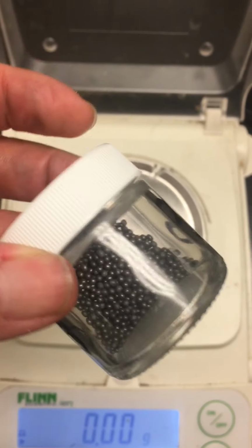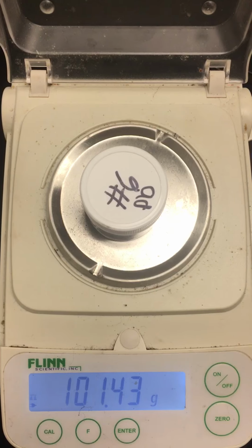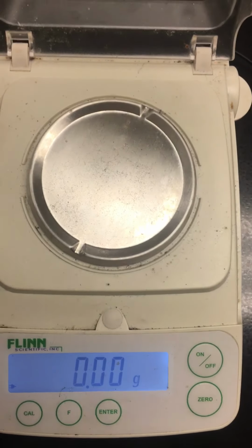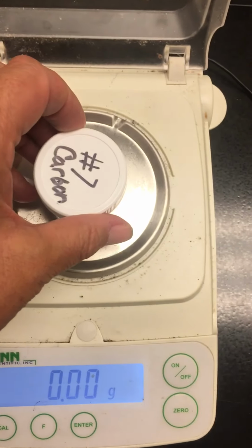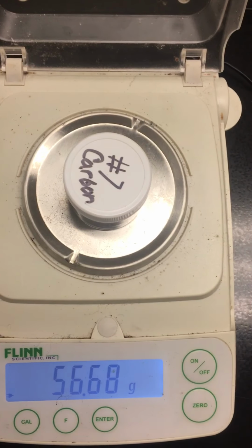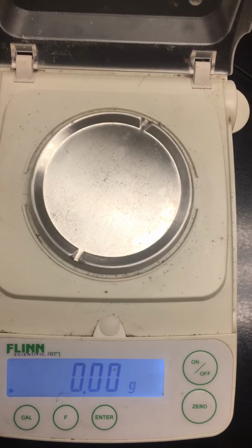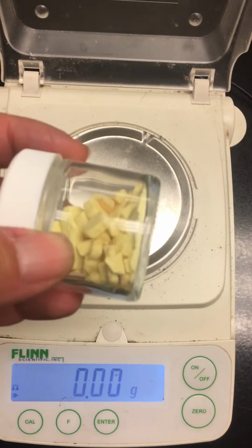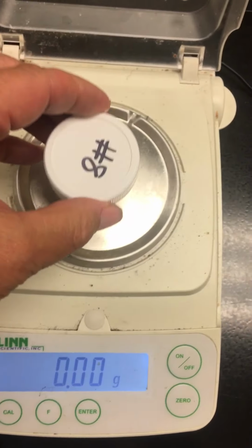Mass of number 6, little BBs. Mass of number 7. Mass of number 8. This could be a yellow powder, but this powder is kind of old, so it chunked up a bit.